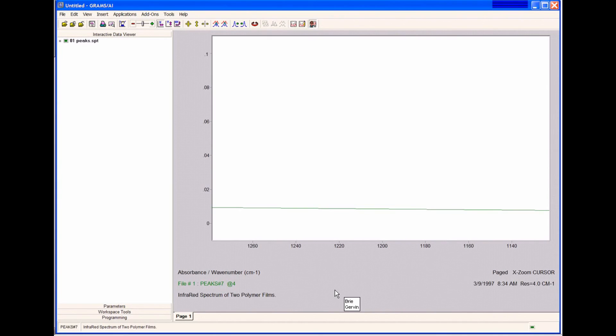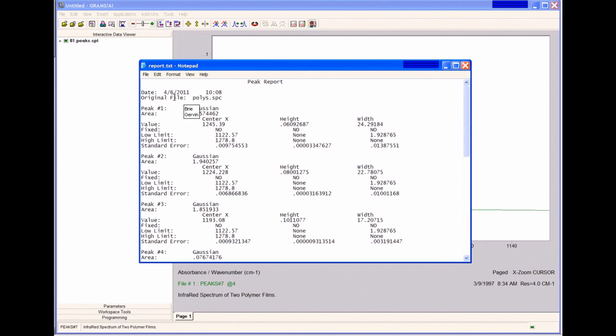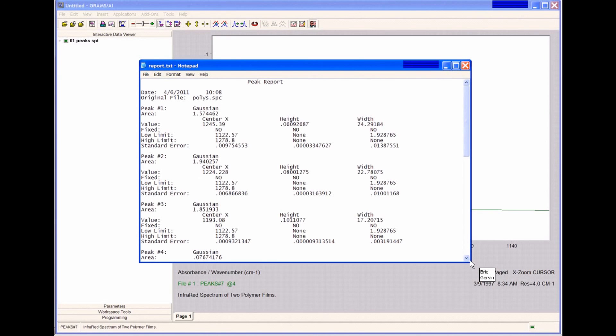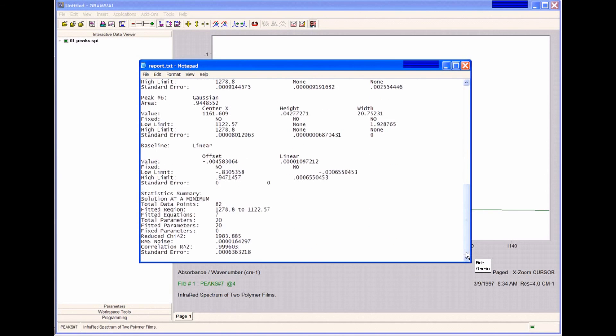Let's look at our reports that we saved. We can first look at our peak report, which is saved to the text file. As you can see in the report, it tells us the date we performed the fit, the file we used, and the information about the peaks that we fitted. I can scroll down. There's information about all the peaks and the baseline, as well as our statistics summary for the goodness of the fit.